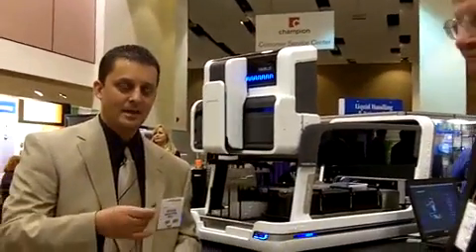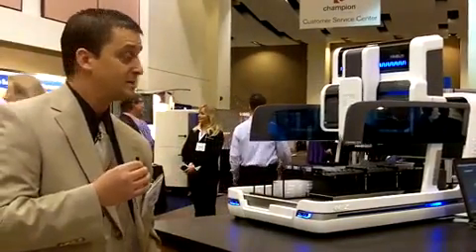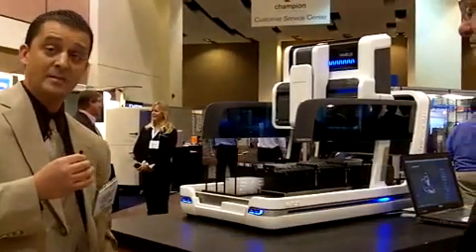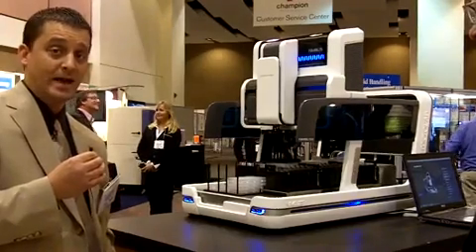Thanks, Tim. This is the Microlab Nimbus iProbe — our latest addition to our automated liquid handling portfolio. It's part of the Nimbus family. We launched the Nimbus 96 one year ago, and that had a 96-channel multi-pipetting head.